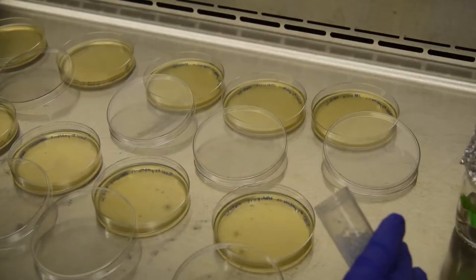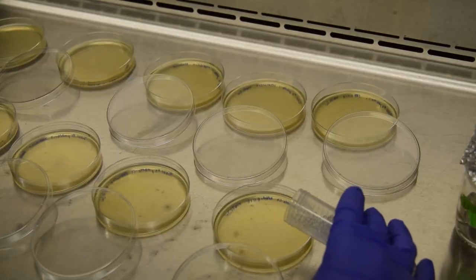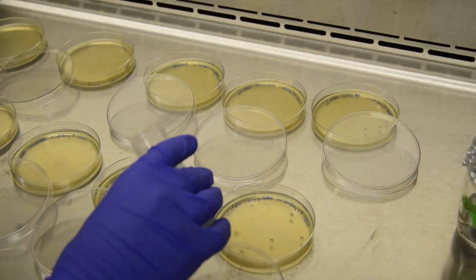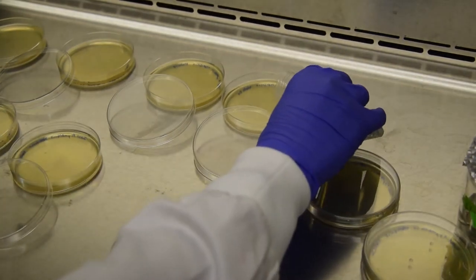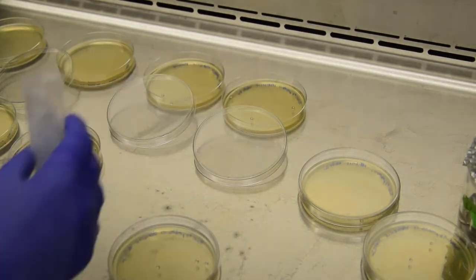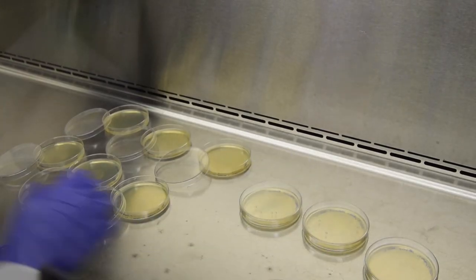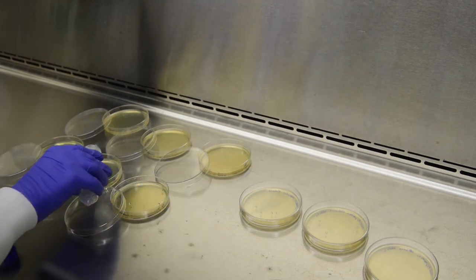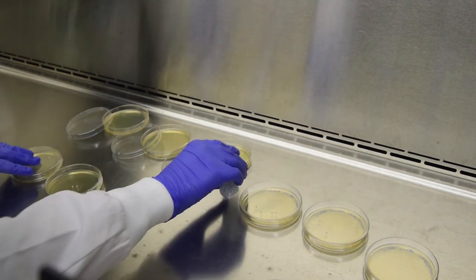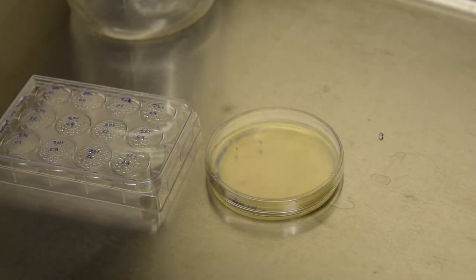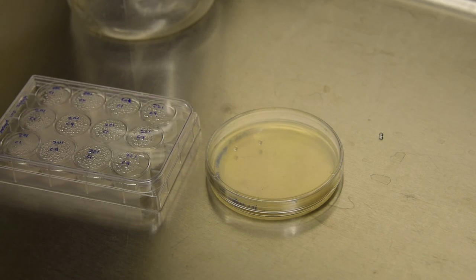Next, we will be plating the co-culture suspension onto selective medium. This is YPDA with chloramphenicol 34 mg per liter and G418 at a concentration of 100 mg per liter. Add at least 3 sterile glass beads to each of the plates. Take up to 200 microliters of the cell suspension and transfer to the selective medium.